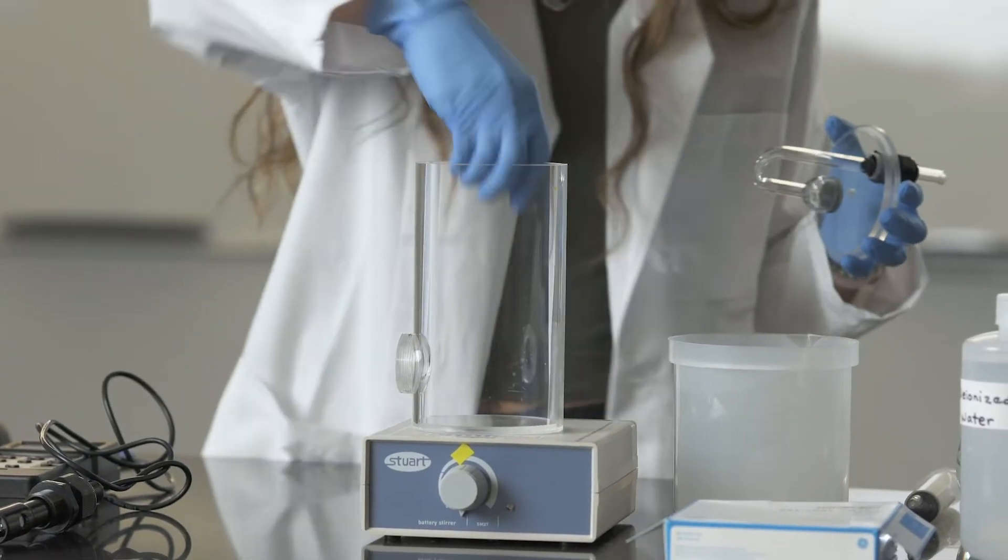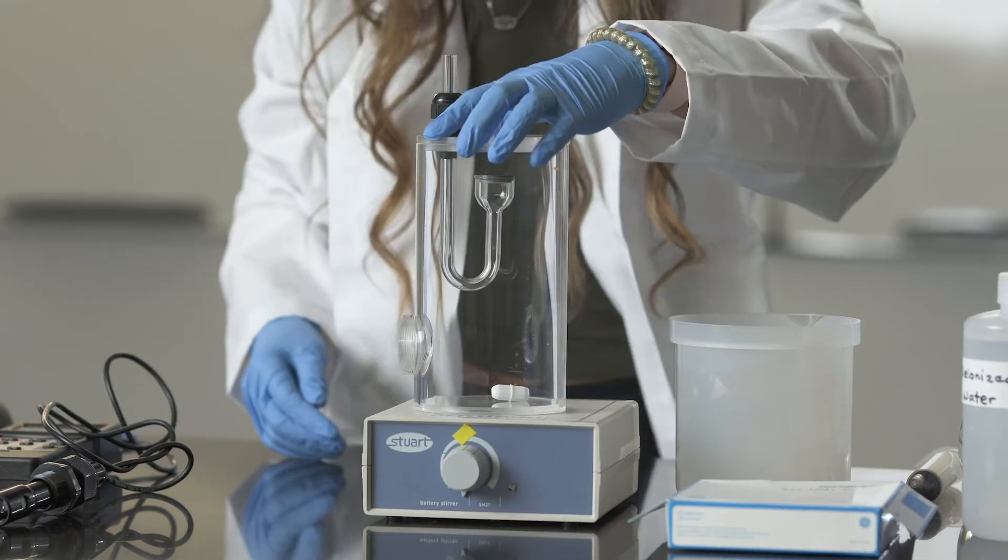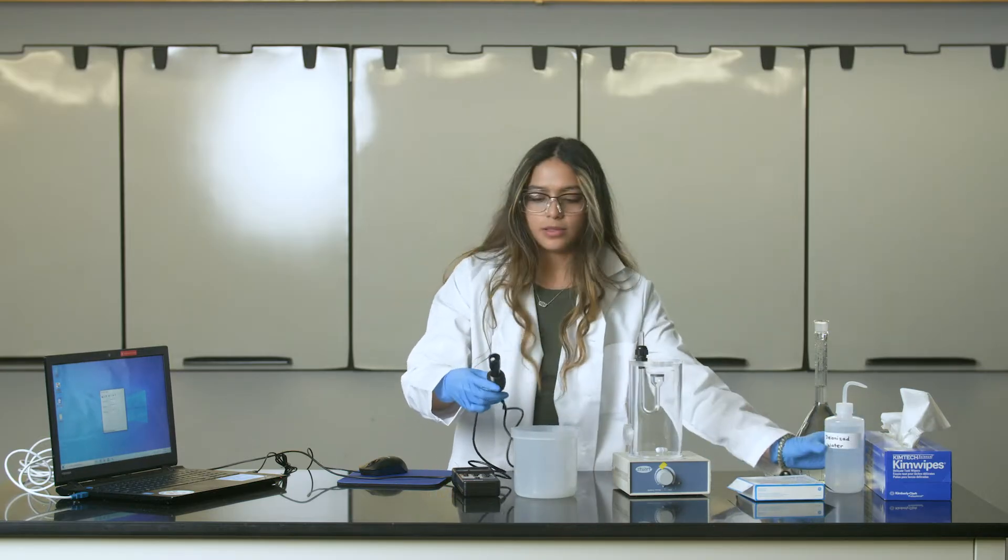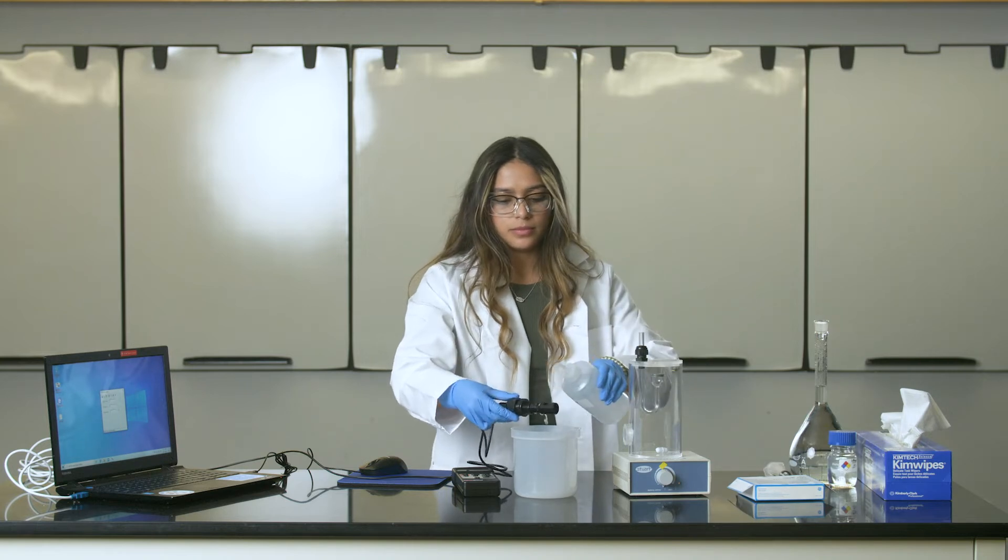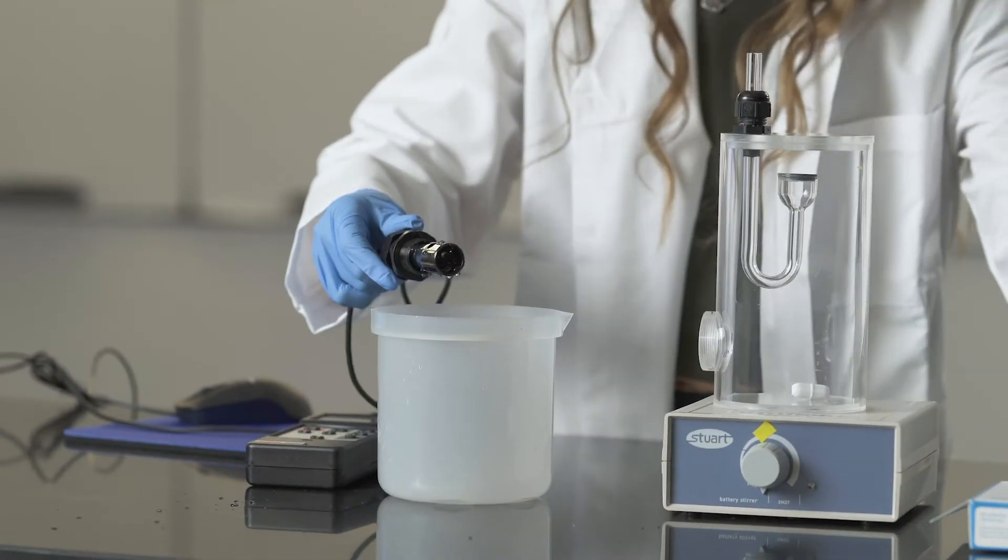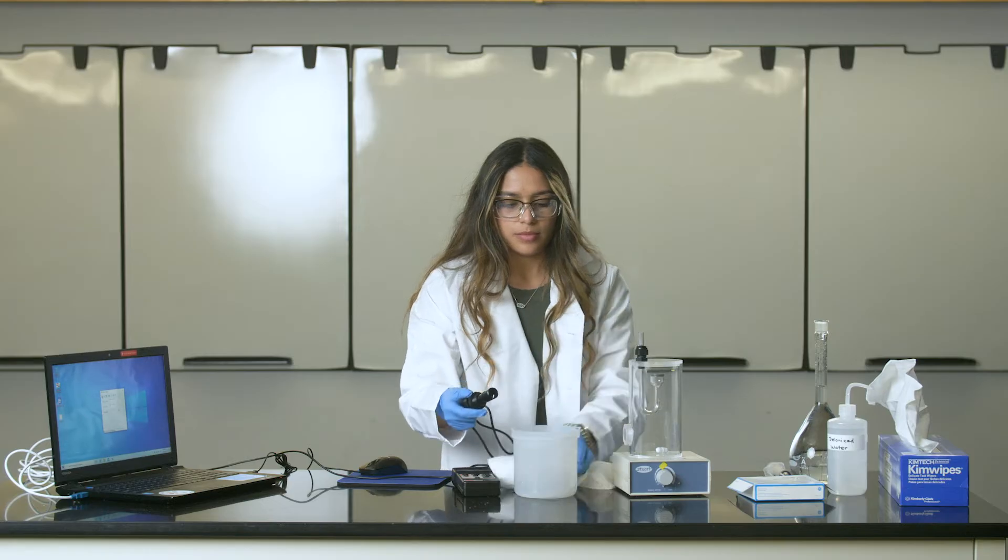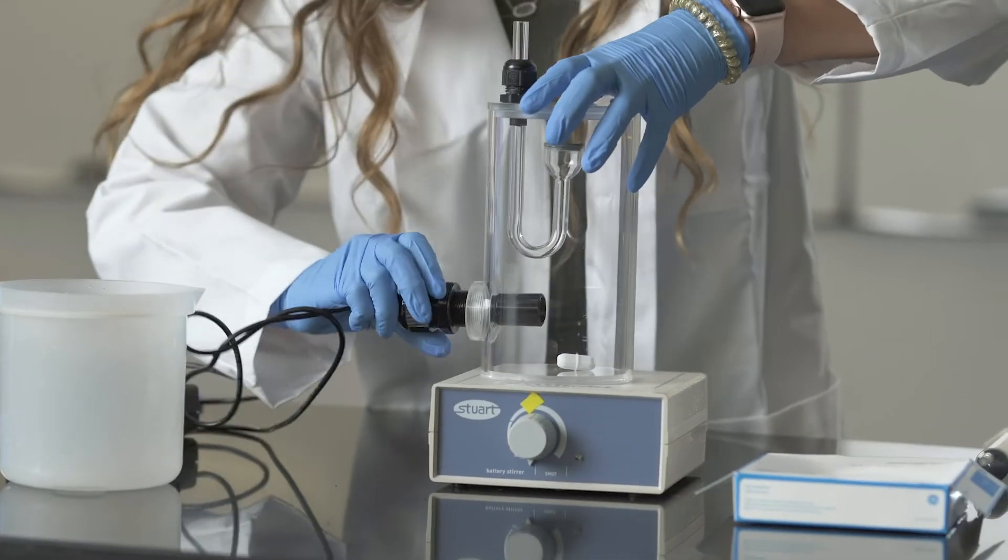Place the stirrer inside of the diffusion vessel and then rinse the electrode with pure water. After it's rinsed, dry with the kim wipe and secure it tightly inside of the vessel.